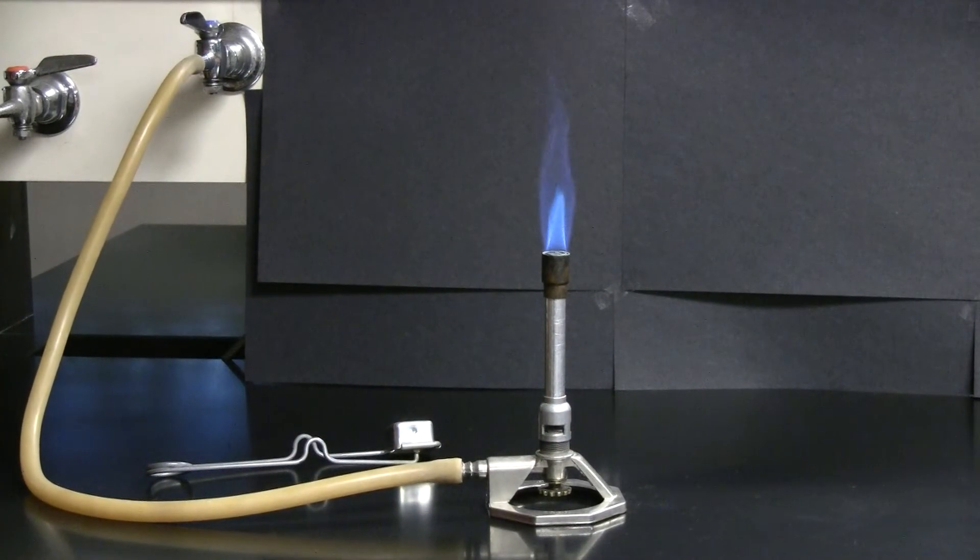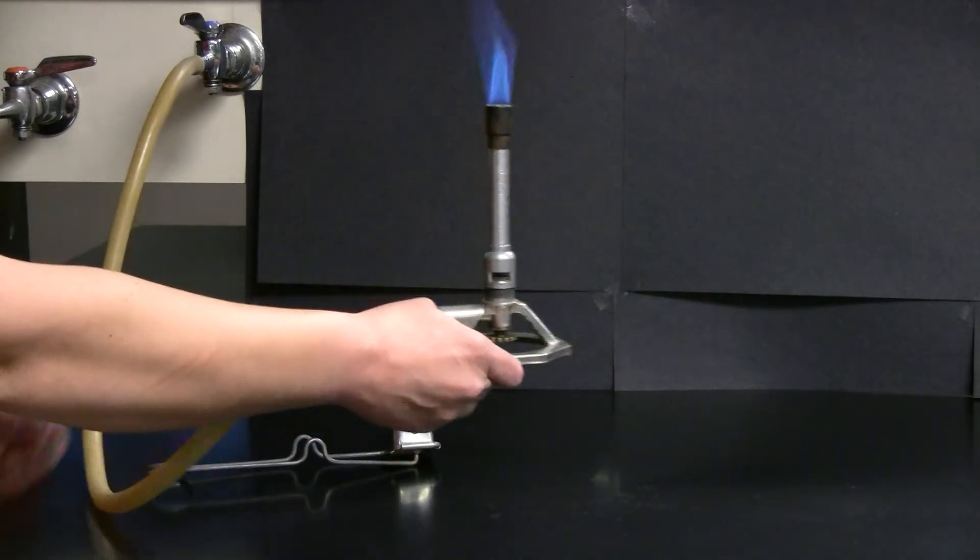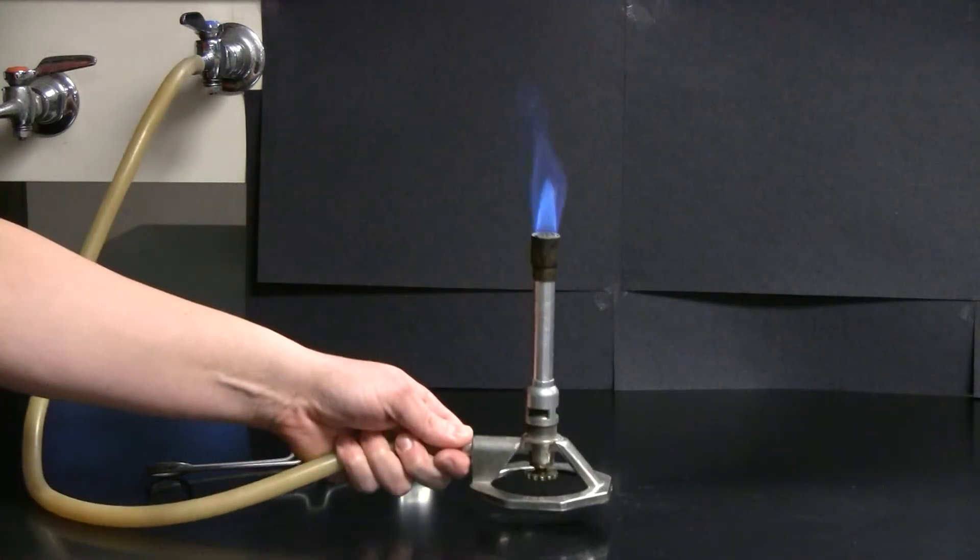When you handle the Bunsen burner once it's lit, you can always handle it from the bottom of the Bunsen burner, either by the hose or from the ring at the bottom. Those areas will stay cool.